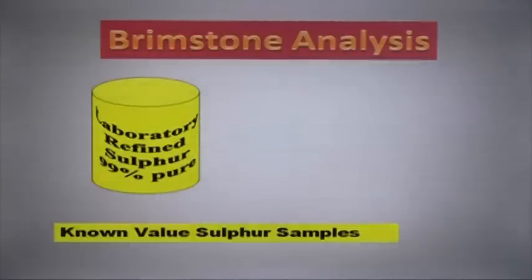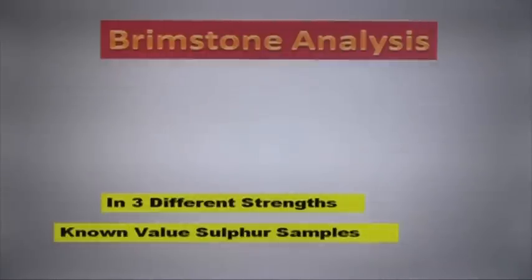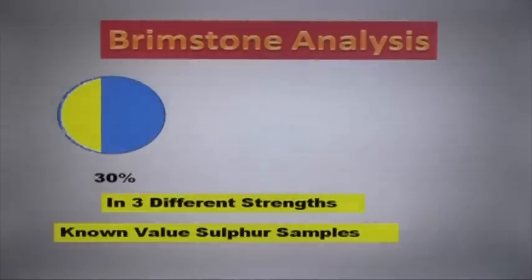We take our laboratory refined sulfur, which we know the value of, and we mix it with a substance called lithium carbonate. We do this for two reasons. We get a very even sample because the lithium carbonate is a binding agent, so there's no lumps and bumps in the sample that the machine's going to look at. We also do this so that we can make samples in 3 different strengths.